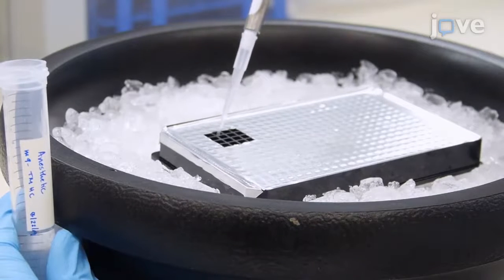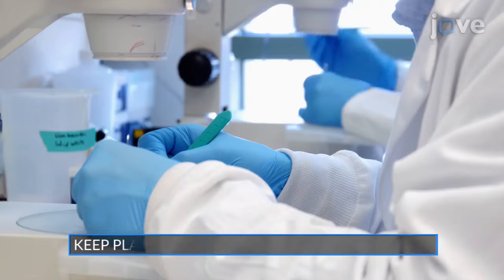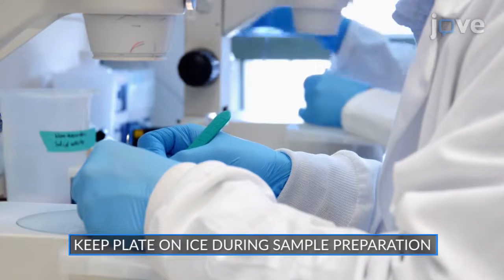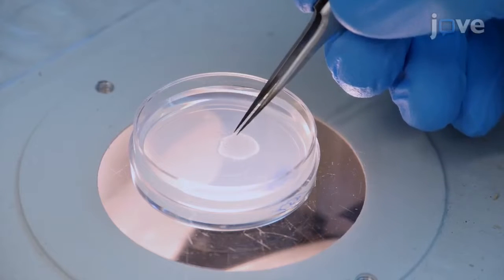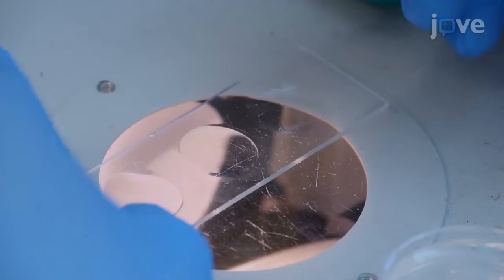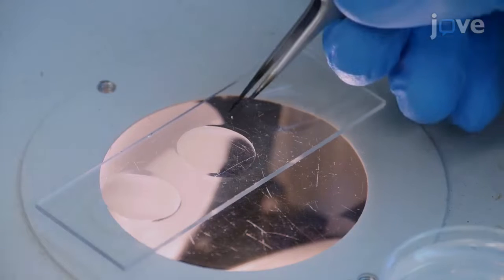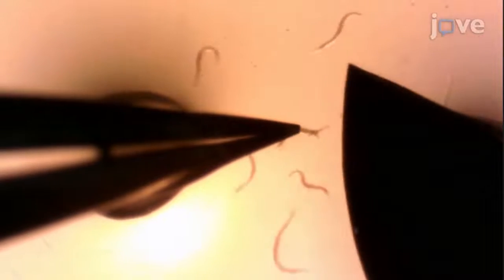For rapid sample preparation, side-by-side dissection by two researchers is recommended. When all of the solution has been plated, use fine tweezers and a dissection microscope to transfer about 10 gravid adults into 150 microliters of ice-cold TMHC solution within one depression slide per condition. Using the tweezers and a scalpel, dissect the worms to release the embryos.